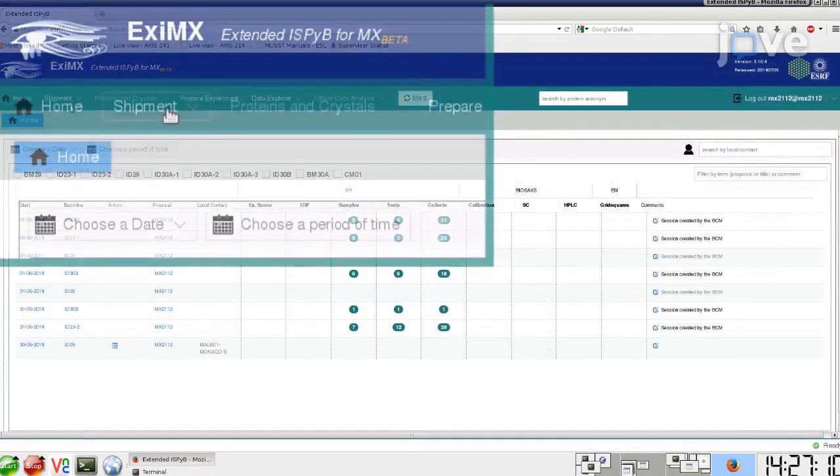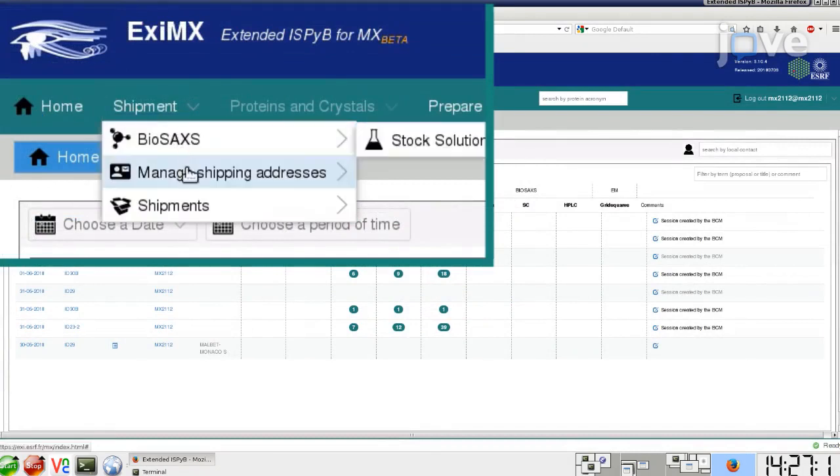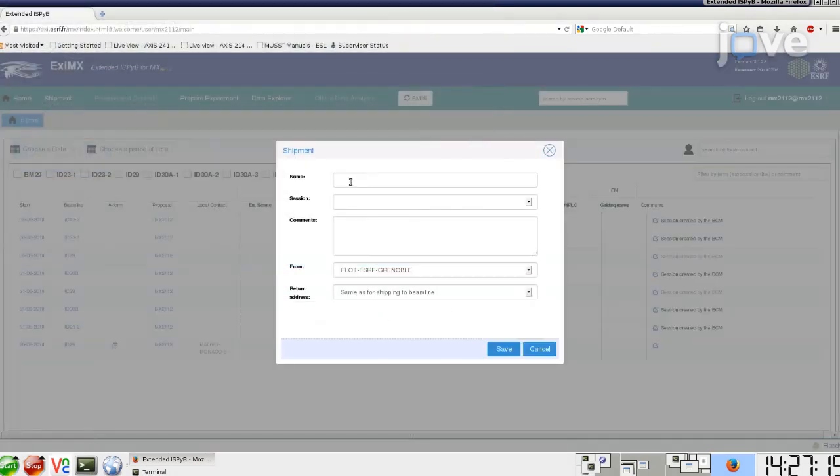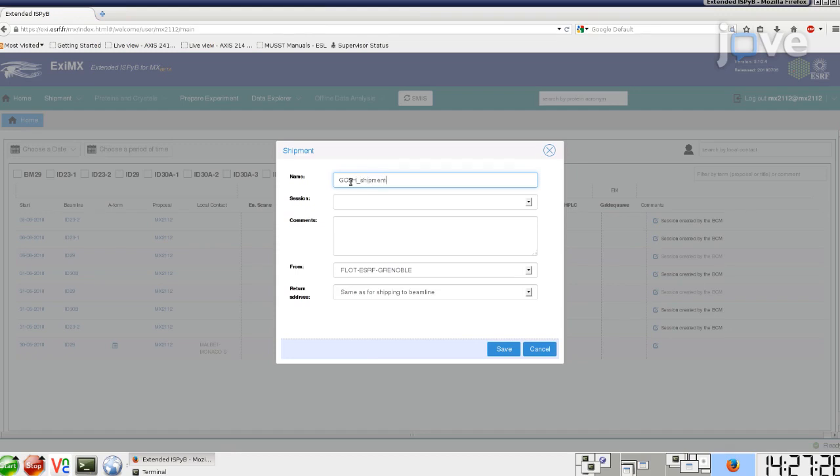Click on Shipment, Add New, and provide the necessary information. Then click Save.